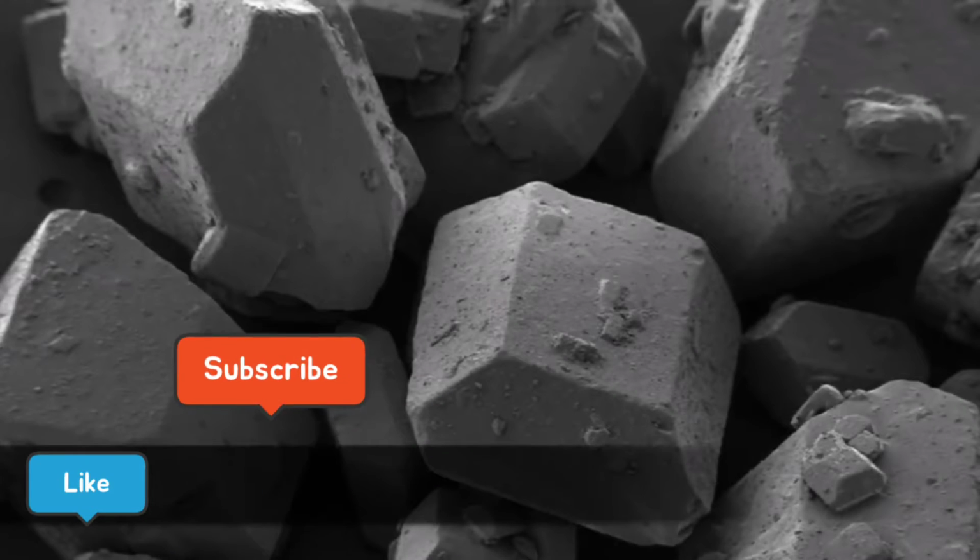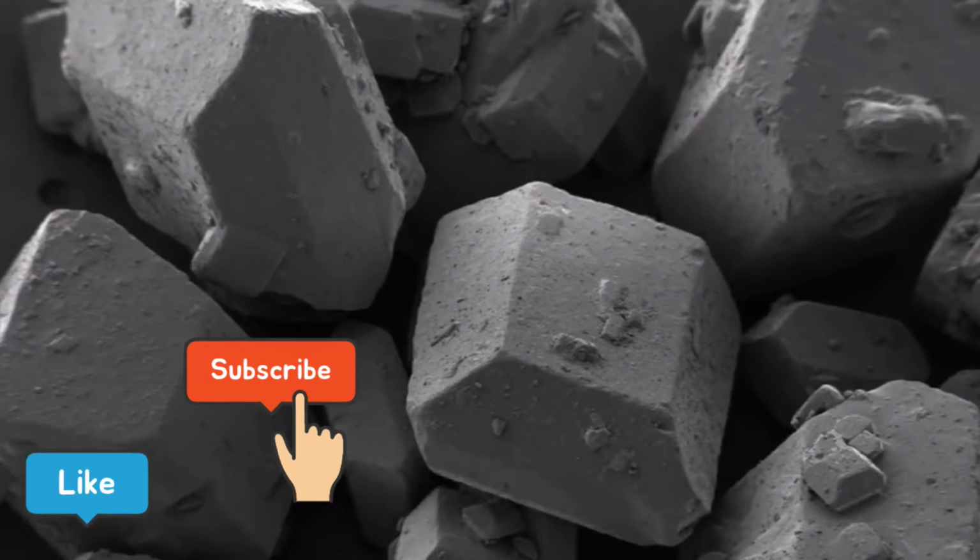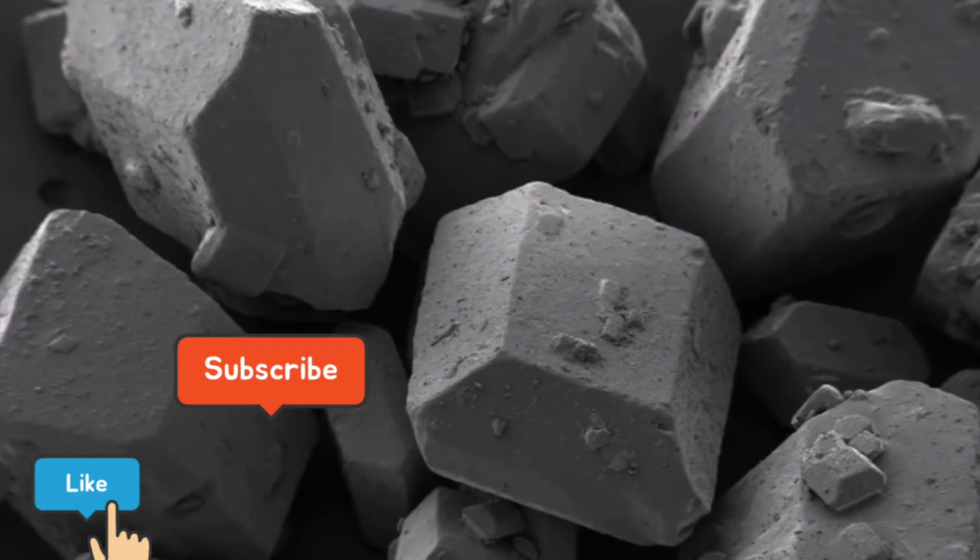If you look closely at dry sugar, you'll notice it comes in little cube-like shapes. These are sugar crystals, orderly arrangements of sucrose molecules, which are composed of 12 atoms of carbon, 22 atoms of hydrogen, and 11 atoms of oxygen.